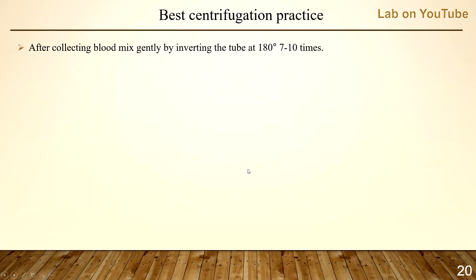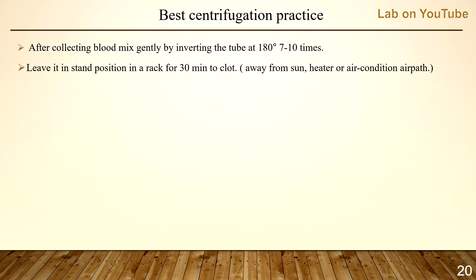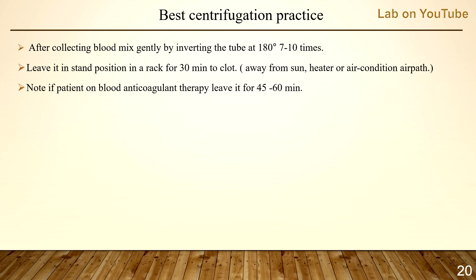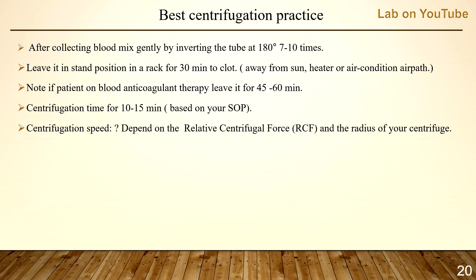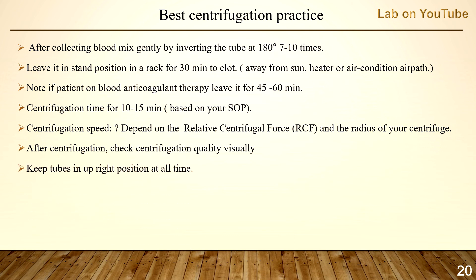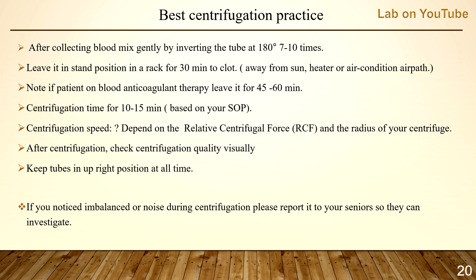Best centrifugation practices: after collecting blood, mix gently by inverting the tube 180 degrees 7 to 10 times. Leave it standing in a rack for 30 minutes to clot, away from sun, heater, or air-conditioning airflow. Note: if the patient is on anticoagulant or blood thinner therapy, leave it for 45 to 60 minutes. Centrifugation time is 10 to 15 minutes per your SOP. Speed depends on RCF and centrifuge radius. After centrifugation, check quality visually, keep tubes upright, and report any imbalance or noise to seniors.